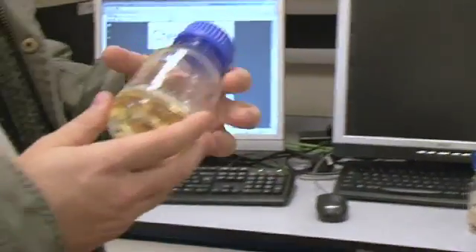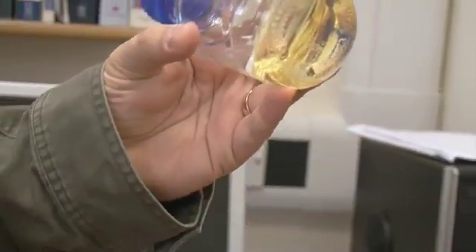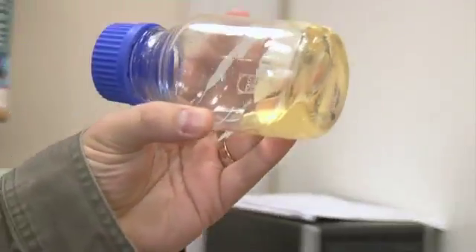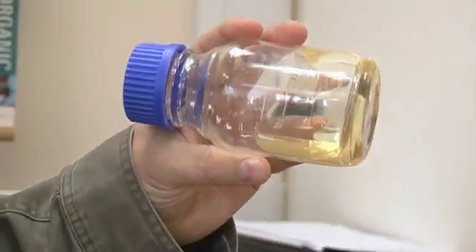Here is a sample of an ionic liquid — a simple ionic liquid that my group made. You can see that it flows like a liquid but it's quite thick and treacly. We've dissolved catalysts in these solutions and put them into our machine so that we can look at the liquid properties of that metal and see what happens to its core electrons close to the nucleus as we do chemistry.